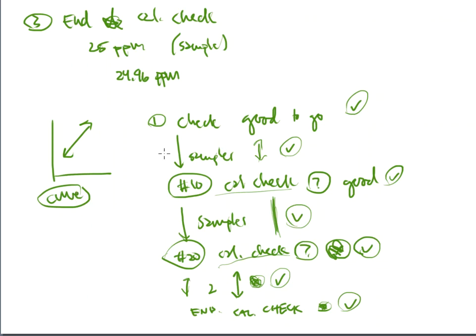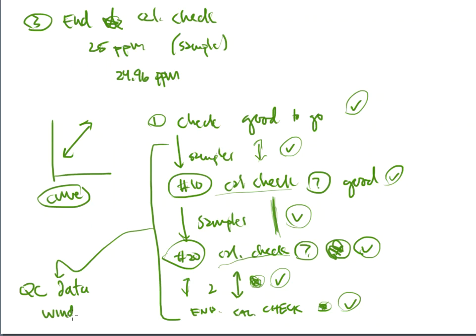Each one of these, in the quality control area of the method, will give you QC data, and they will give you an acceptable window. That window will typically be in terms of a percentage, and it will say if you make a 50, it should be within plus or minus this percentage of that number. If you make a 10, it should be within plus or minus a certain percentage of that number. So all of this is going to be method determined or laboratory determined depending on who you work for. Again, that's what we'll use to go by if it checks off or if it fails.